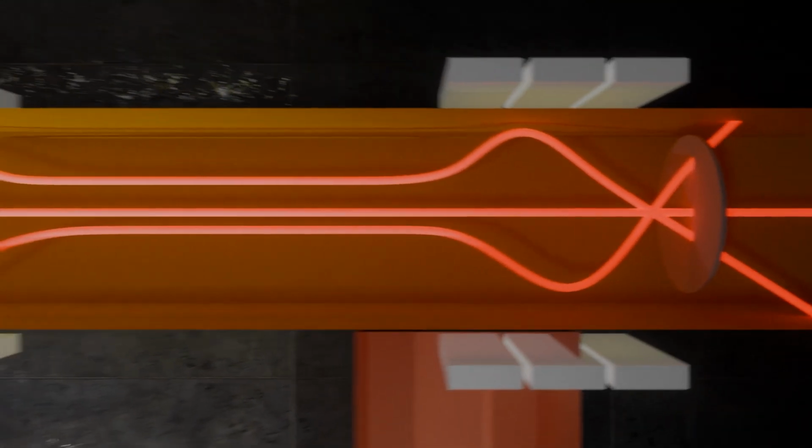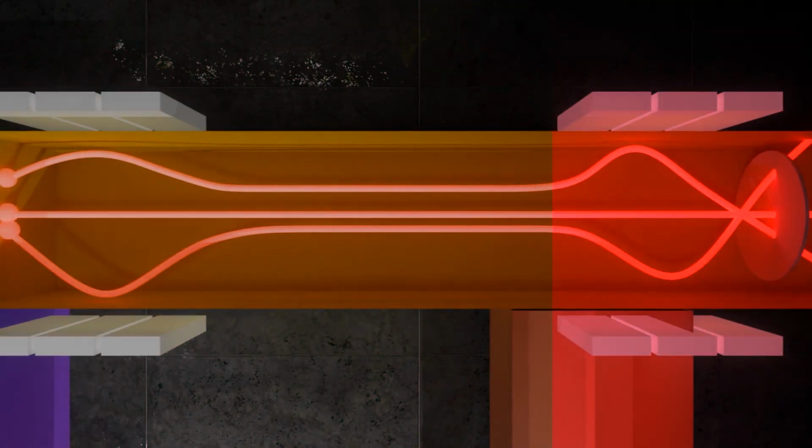A kind of crucial thing to remember here is that these distances are just there for the sake of visualization. And in reality, you want these two to be as short as possible and this one to be as long as possible. That's because only if ions travel in parallel can you get the charge to mass ratio and separate them by it.